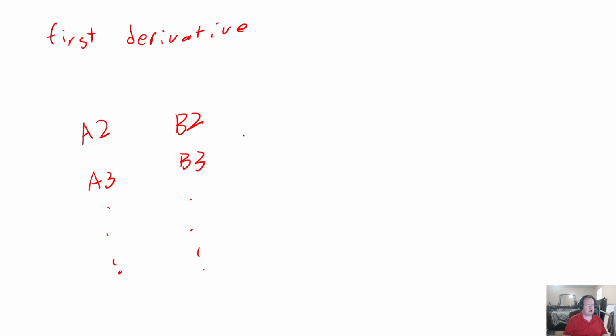And then I'm going to make another column where I look at the difference between these, so I know what the slope is at each point. So I'll go down to my second data point, and then I'm going to set up an equation. The idea behind the equation is I want to take the y points divided by the x points. So here, I would set up an equation like B3 minus B2 divided by A3 minus A2. And the way I have this equation designed, if I were to copy it to lower cells below it, it'll automatically increment the index. So it'll go from B3 to B4 and B2 to B3. So I only have to write the equation once, and it'll do this for all of them.